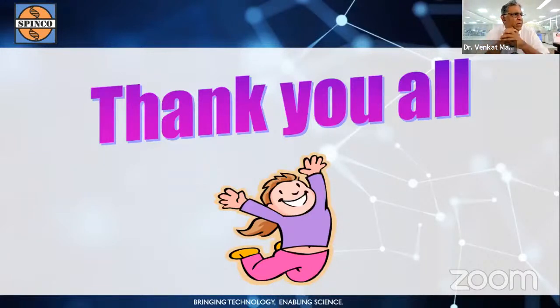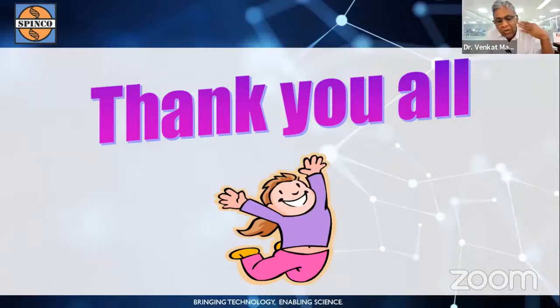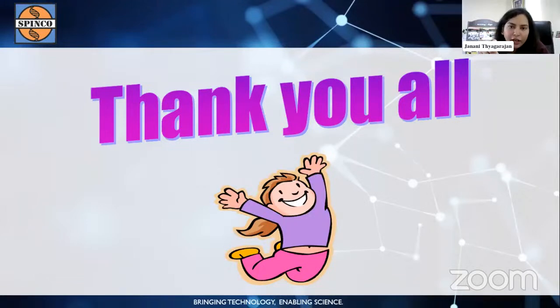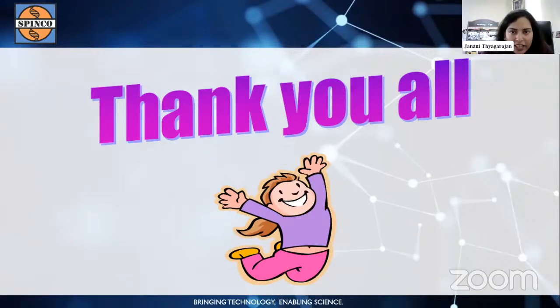Mr. Dashrath Patel has asked, are both forms of ions produced in electron ionization, both positive and negative? I'm not able to understand the question. But we can do both positive as well as negative ionization.